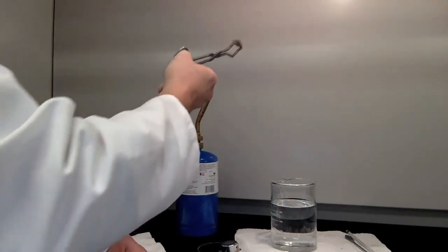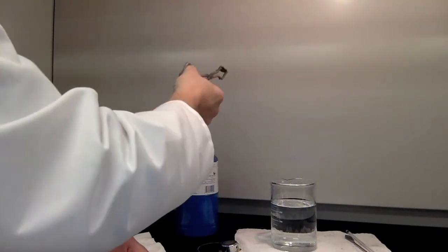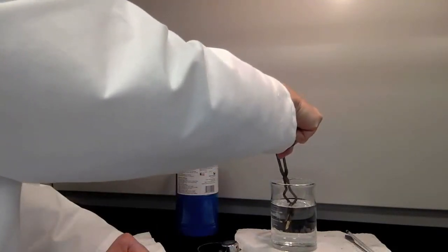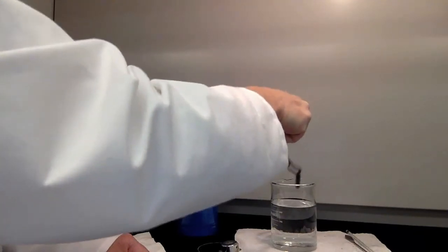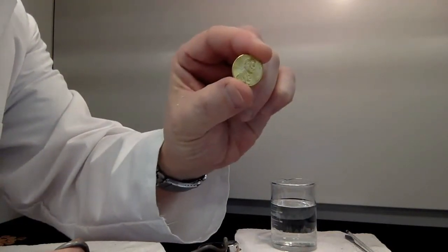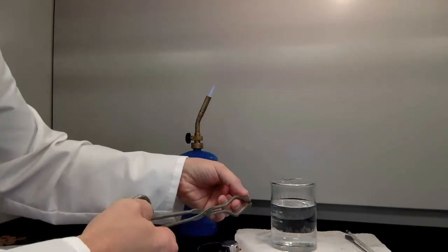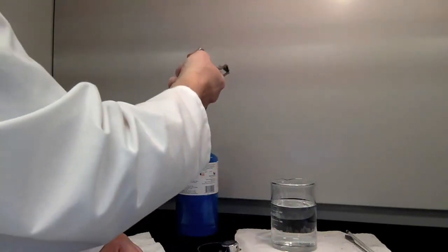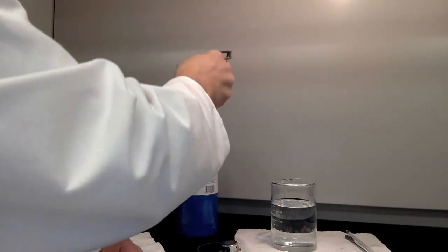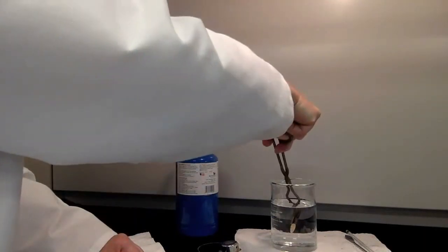Here's another one. So we'll heat it very evenly back and forth until it begins to change color. And then when it does, I quench the reaction like so. And again, beautiful gold penny. One more for good measure. Last one. And I can see it starting to change color, and when it does, there we go.